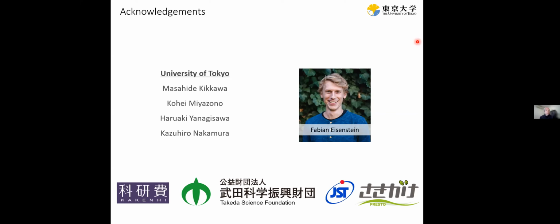Yeah, that's a really good point. So the differences are really small, of course. And that I would say is a good sign, meaning that the factors that maybe had a really small experimental impact, like the aperture, didn't show erroneous signal in a sense. The differences were calculated based on B-factor plots. So first we made the B-factor plots done with random particle subsets. So it's not just taking the final resolution of the subsets we got. We also did these random subsets. So it's a bit more, I would say, quantitative.